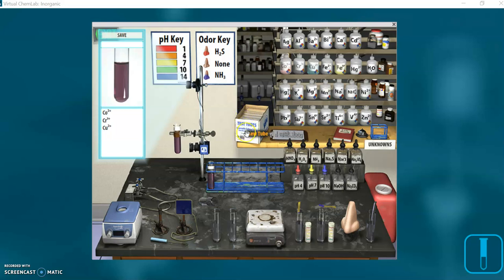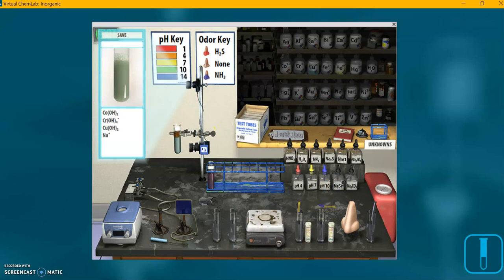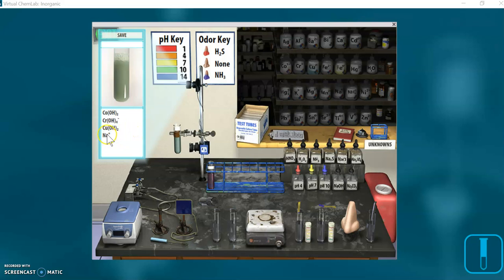I'm going to try some procedures now. Over here on the reagent shelf, I'm going to click on the sodium hydroxide. Take a look at our solution as it is — it tells us what ions are present. Watch the change: as soon as I click the sodium hydroxide, it will be added and you will see a change. It went from a clear solution to a cloudy solution. We have two precipitates — the copper and the cobalt hydroxides — and two soluble ions: sodium and the complex chromium ion.